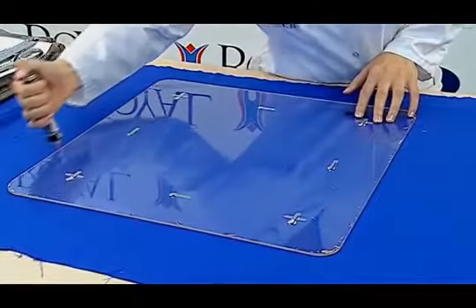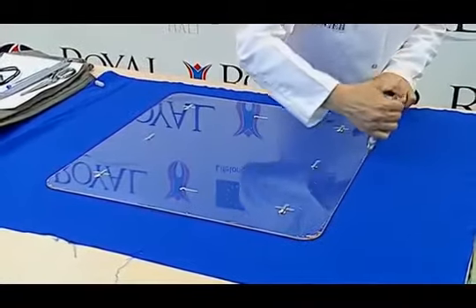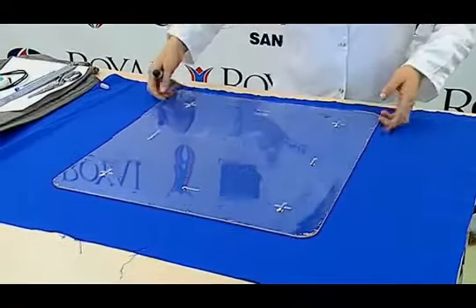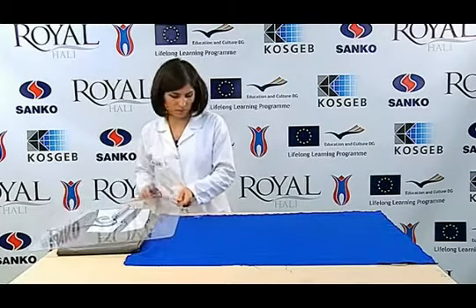The drawing is done again to identify the location of the cutting on the edge of the template. The marked parts are cut.